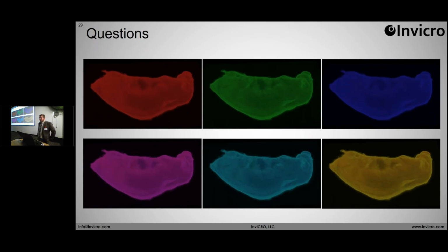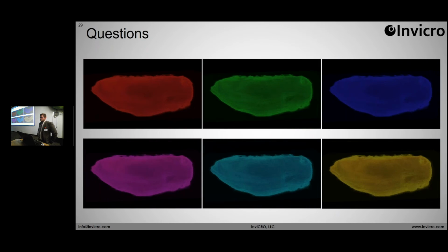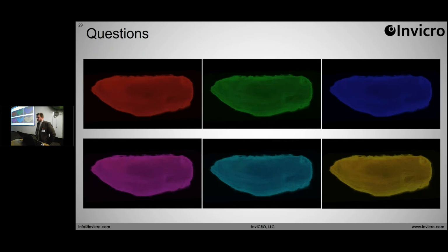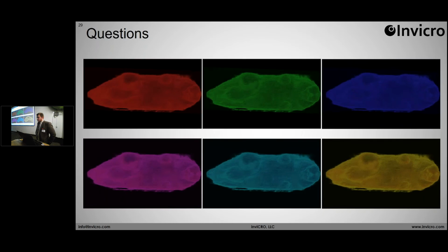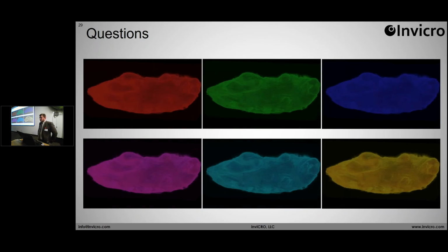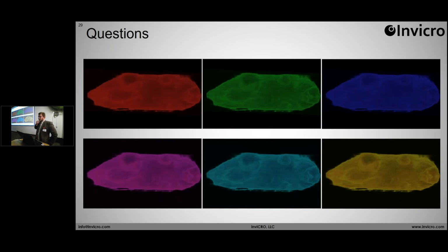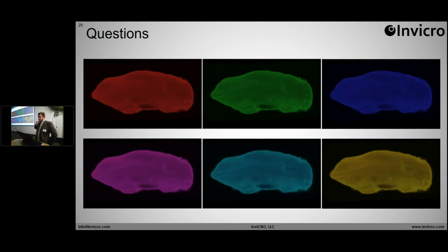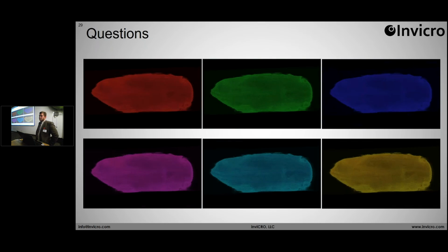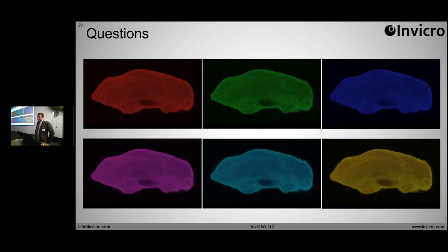Yeah, I have a slightly design-related question. Say you have a fluorescence ligand where you need an IVIS image, where you need X-ray or tissue level image. We know the amount that we inject. And if you do this biosectioning, every gray region should be above the background. We want to see the biggest signal. We roughly know it's there, but what amount should I adjust my ligand to get a good 3D section?